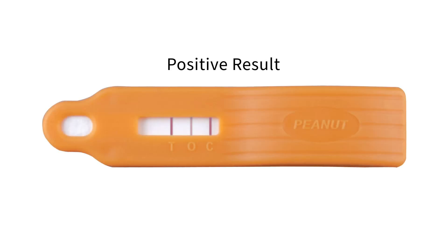A positive result is indicated by lines visible at positions O and C, together with a line of any intensity visible at position T, meaning the level of peanut in the sample was at or above the test's detection limit. For high positive results, a line is visible at position C, no line is visible at position O, and a line is visible or absent at position T — indicating the sample is overloaded or has a high level of contamination.